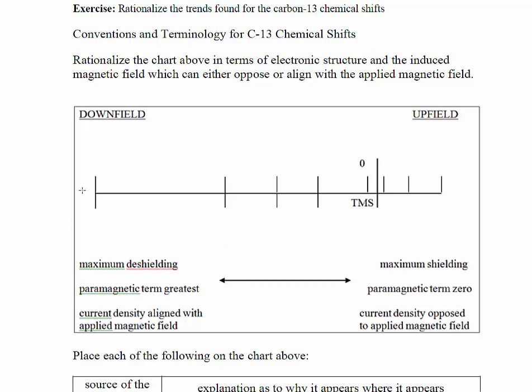Here we're looking at the layout of a typical NMR spectrum, left to right. Downfield refers to all of the things that appear as you move to the left on this figure. Upfield refers to the direction on the right-hand side. Nuclei that are upfield are there because in the old days you'd have to turn the magnet strength up in order to see those resonances.